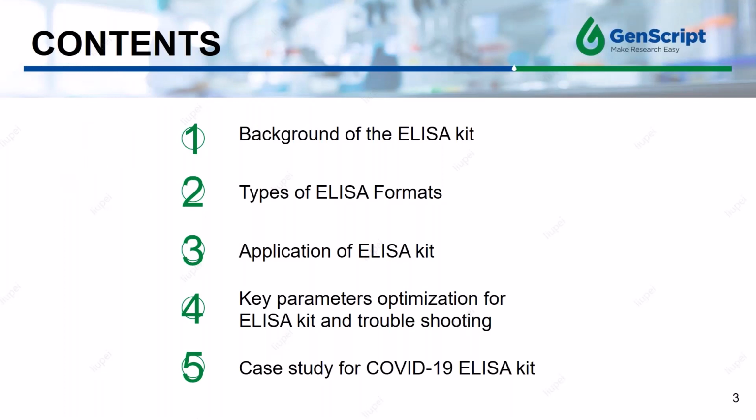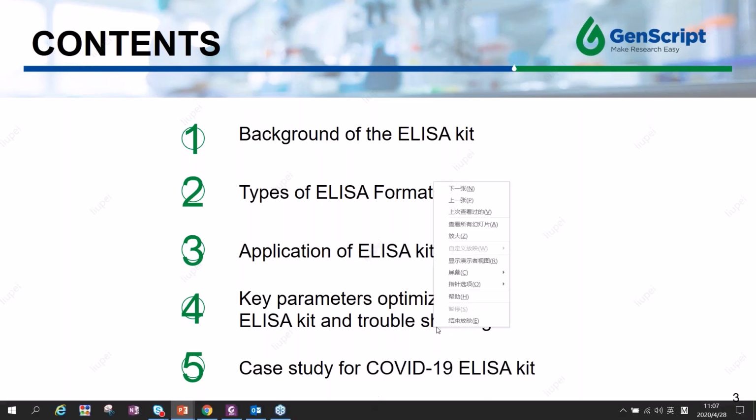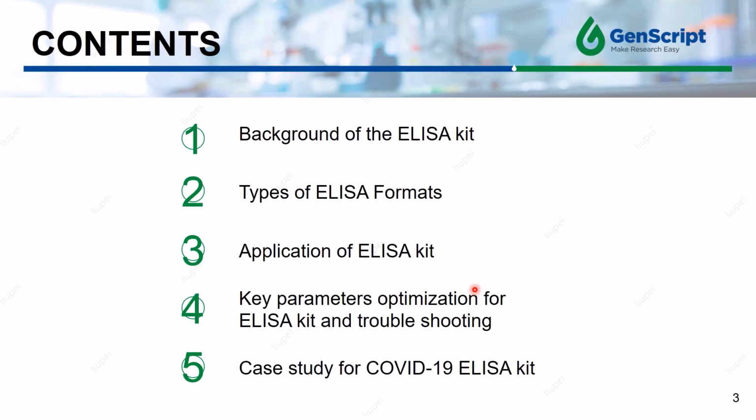Here is our outline of our topic. We will go through principles and general types of ELISA, then the application of the kit. Most important, I will introduce how to generate an ELISA kit and how to troubleshoot ELISA assay. We will also review how GenScript generates ELISA assay for our customers. Finally, some cases will also be shared here.